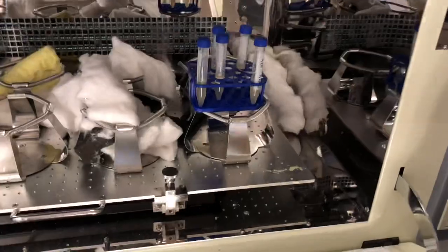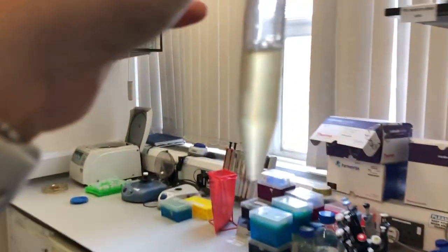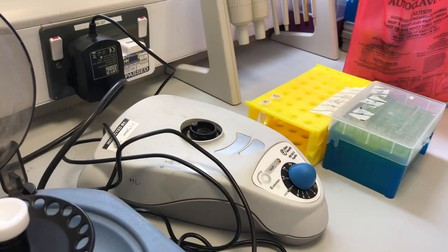Here are some of my bacterial samples just shaking away, and I thought I would wave to them. Sometimes I like to speak nicely to them because I heard that bacteria are similar to plants, and if you speak to them nicely and say kind things to them, then they will grow as you want them to. One can wish.